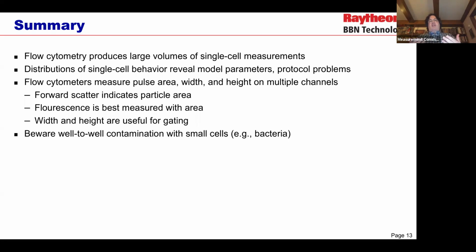So in theory, you should always be hitting it straight on. Like in that look at the machine we saw under the hood, that was all straight lines and 45-degree angles. So it should be hitting with no angle between detector and laser. And that's what you want, because that's going to maximize the signal that comes in.